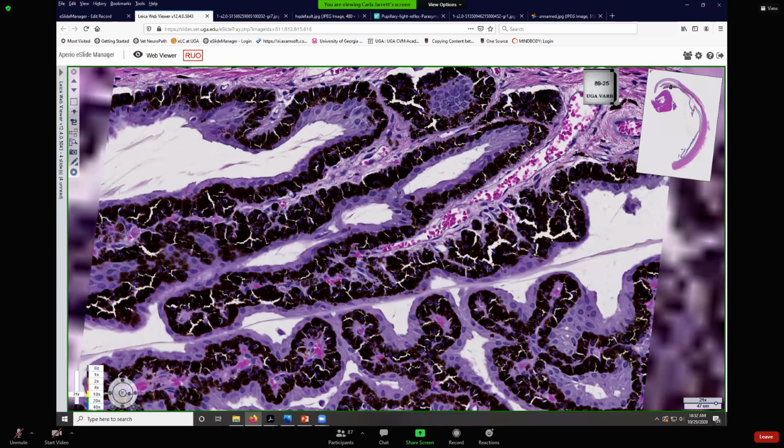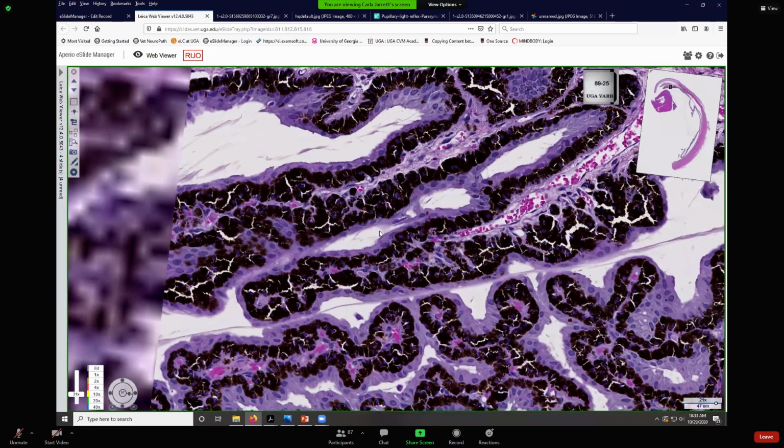They're going to leak a modified fluid, modified plasma, and these epithelial cells are going to transport that and secrete it out into the posterior chamber. So that is how we produce aqueous humor. It's a modification of the blood plasma. So that's something major that the ciliary epithelium does on the ciliary processes.